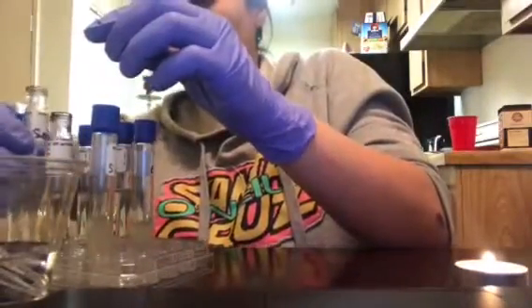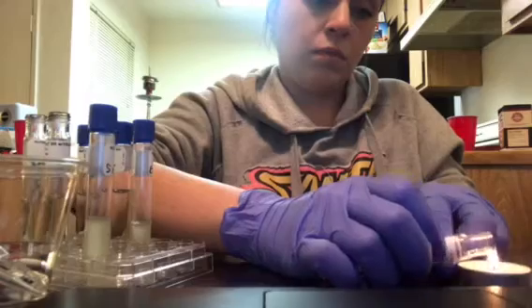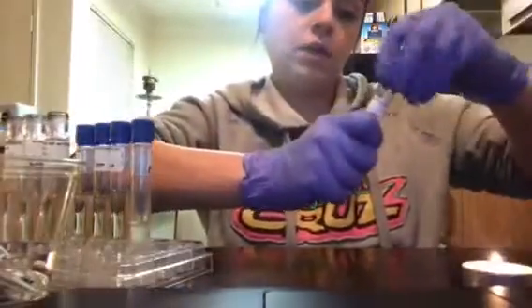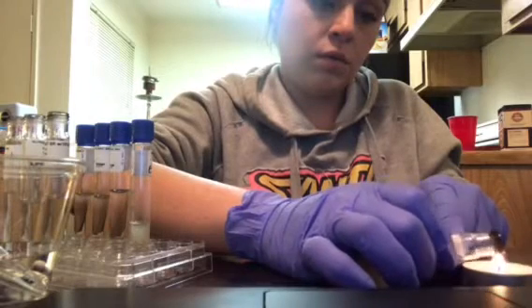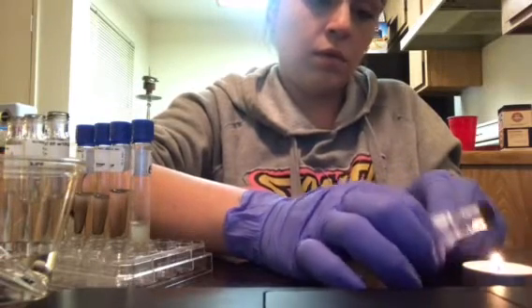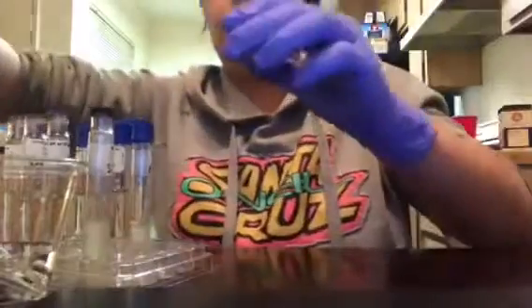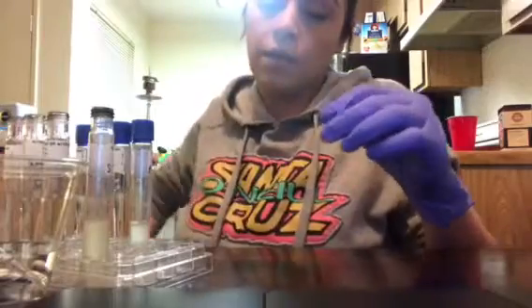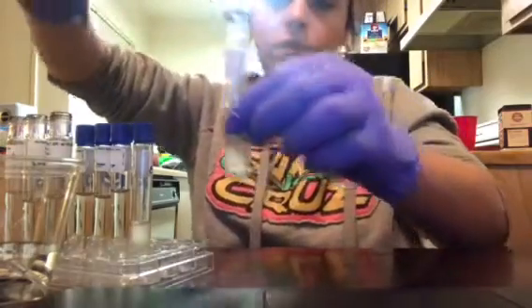Okay. And then the active culture. Okay. So I'm going to set the candle to the side. And I'm going to do the same thing for the S. epidermidis. So I'm going to take the active culture and carefully pipette 2 drops into each one.